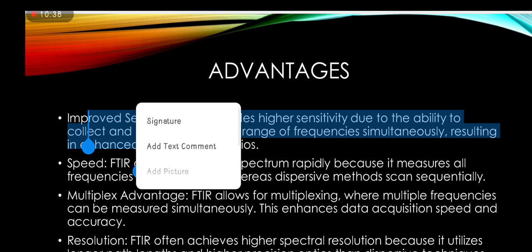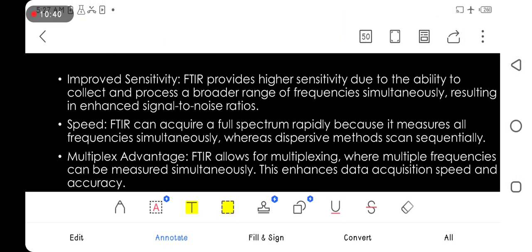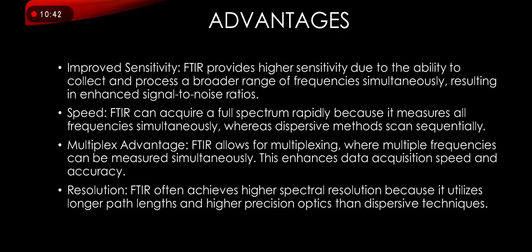Multiplex advantage. FTIR allows multiplexing, where multiple frequencies can be measured simultaneously. This enhances data speed and accuracy. Resolution.